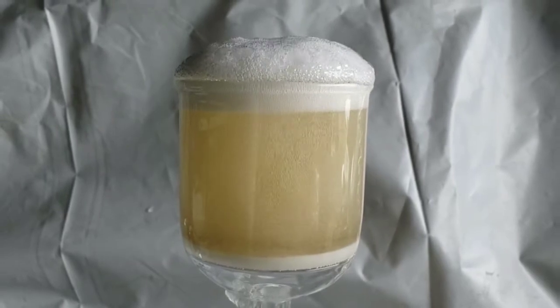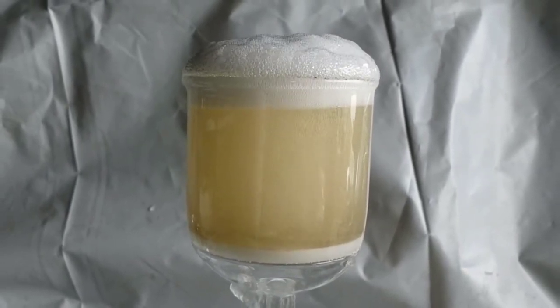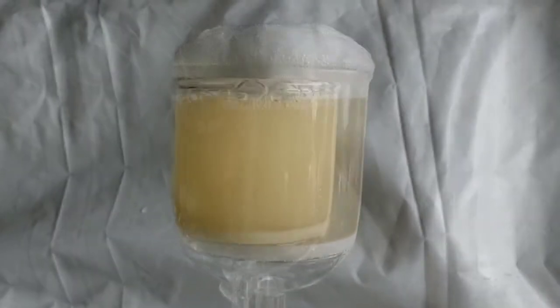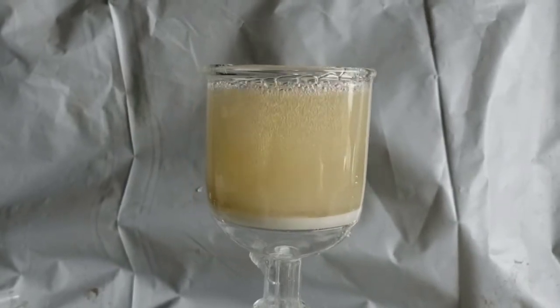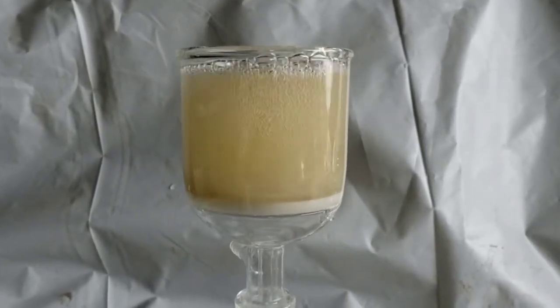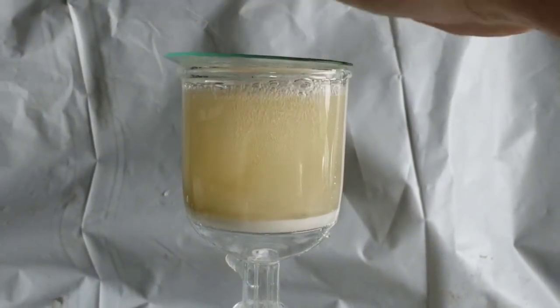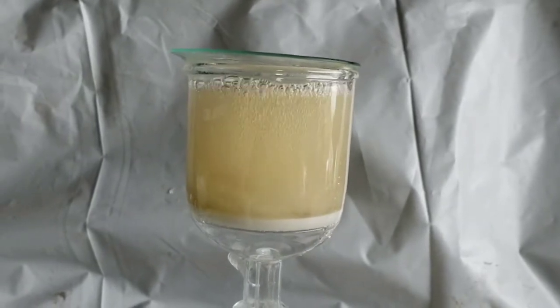It looks like I may have overfilled it, but eventually it settles down. The big bubbles are causing a lot of splash, so I have to cover that up — and again, without gloves. Golly, I really should wear gloves.